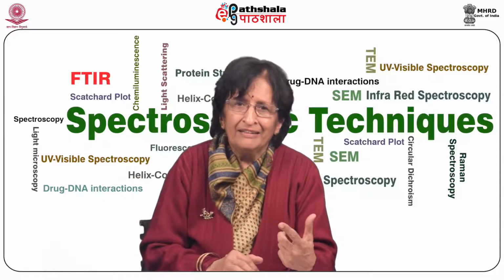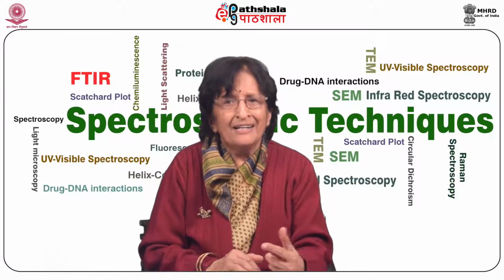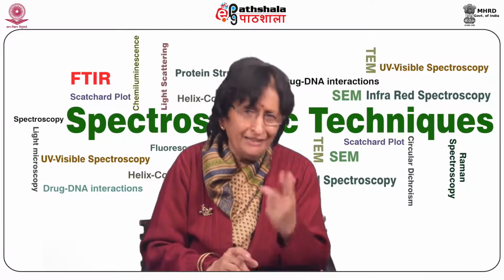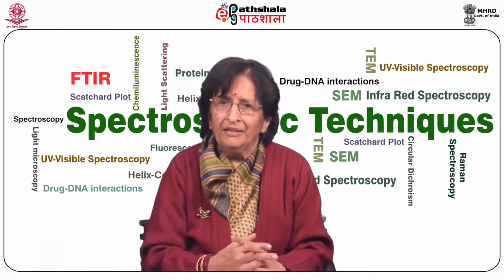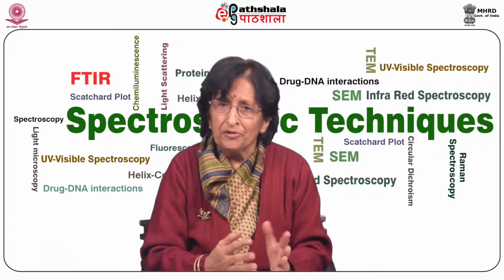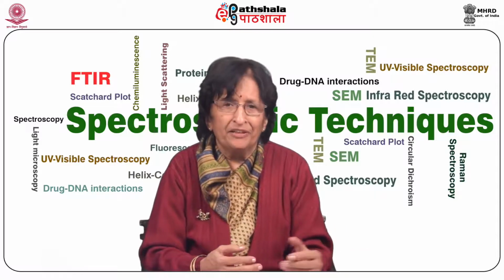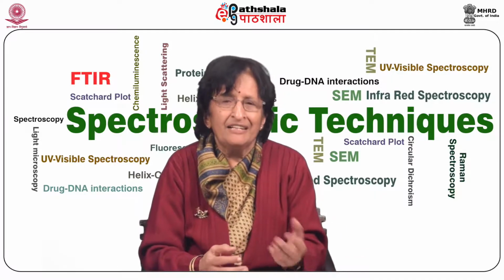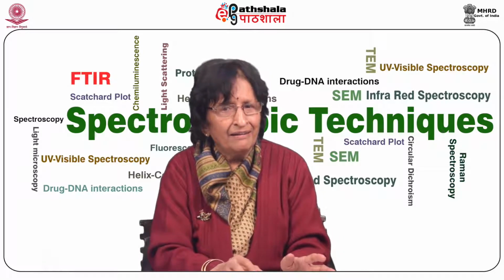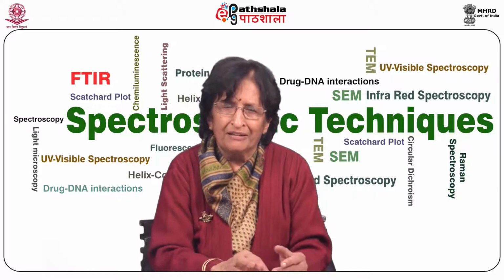As a result, the absorption spectrum of DNA is sensitive to the pH of the medium. At neutral pH, the absorption peak lambda max for guanosine shifts to 253 nanometers and for cytidine to 271 nanometers. This is the reason why polymeric DNA and RNA show a strong absorption band at 260 nanometers.